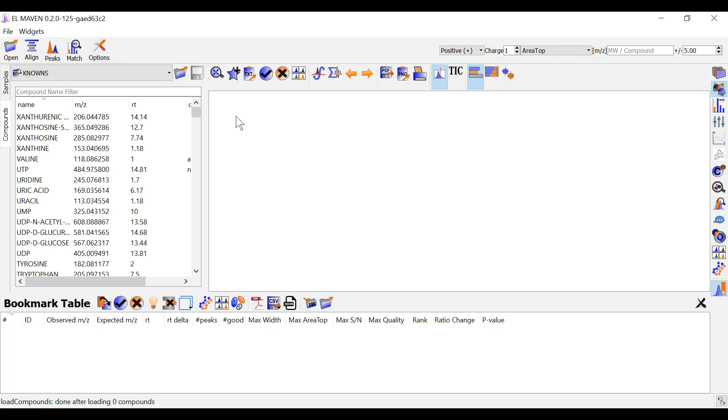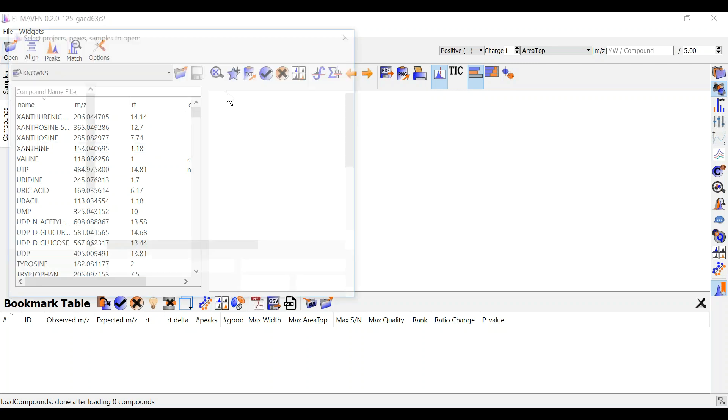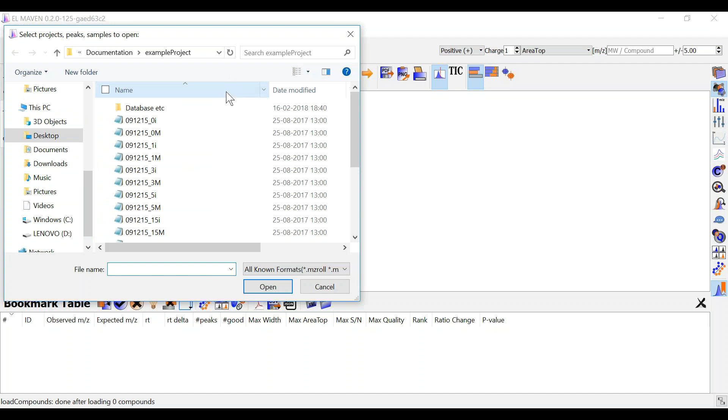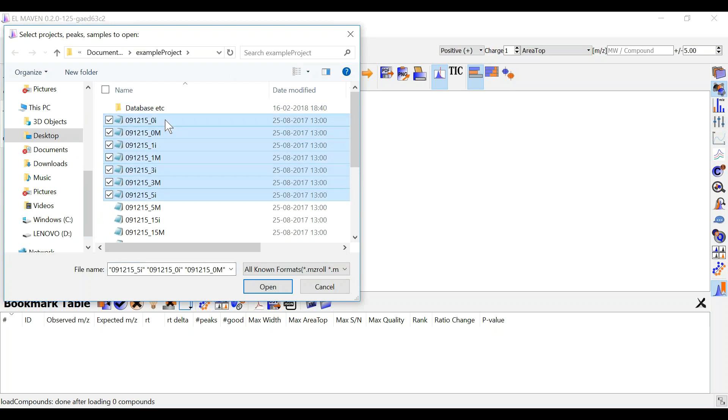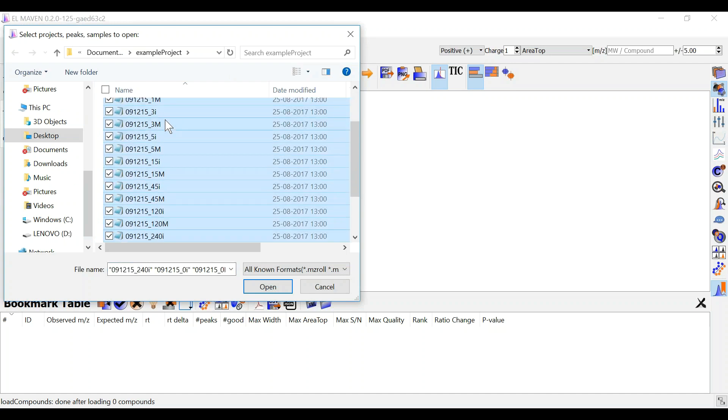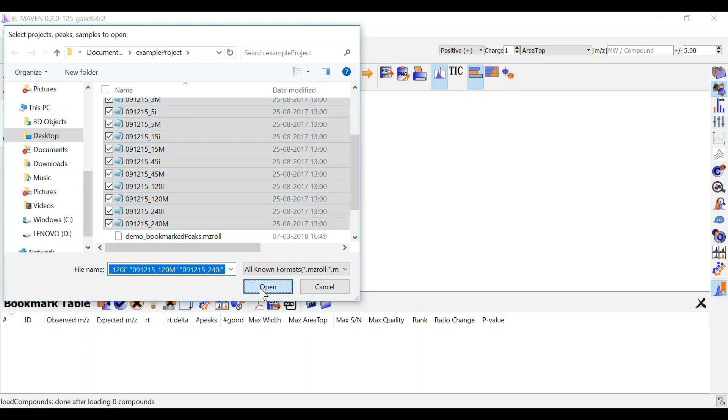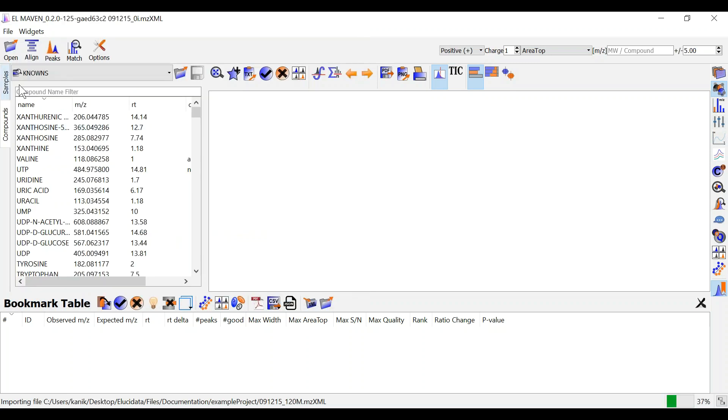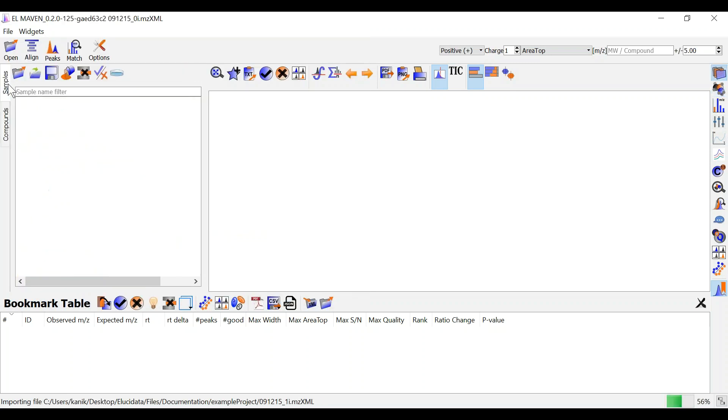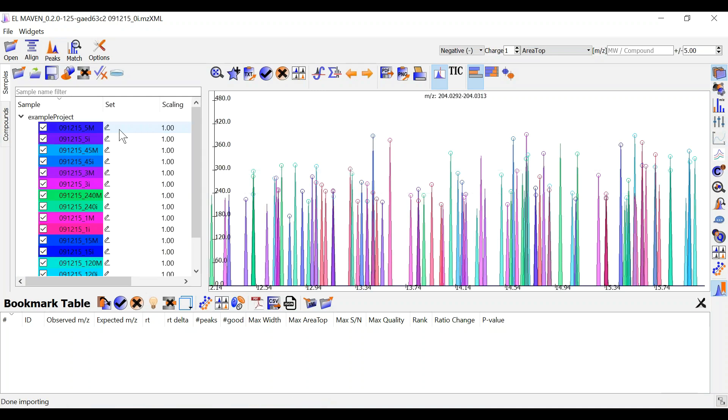Once you are done adjusting your settings you can load samples by clicking on the open dialog. You can select all the samples that you want to process and they will appear in the sample space.